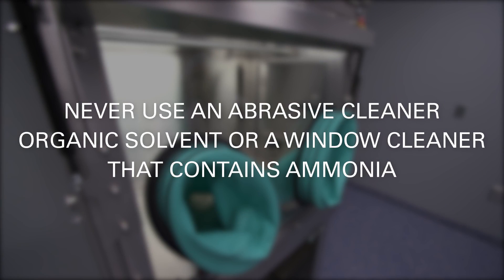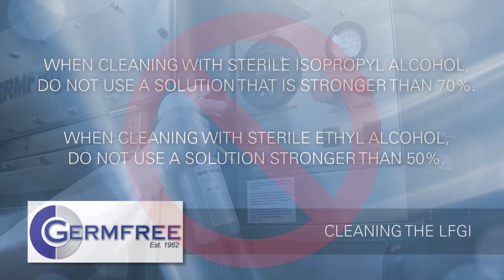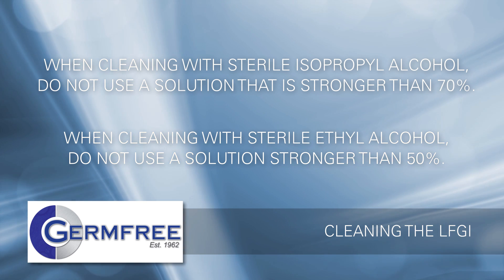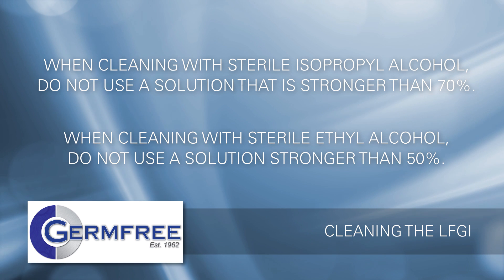To prevent fogging or crazing acrylic surfaces or the control panel, never use an abrasive cleaner, organic solvent, or a window cleaner that contains ammonia. Never spray a liquid cleaner or disinfectant directly onto an electronic instrument or control. When cleaning with sterile isopropyl alcohol, do not use a solution that is stronger than 70%. When cleaning with sterile ethyl alcohol, do not use a solution stronger than 50%.